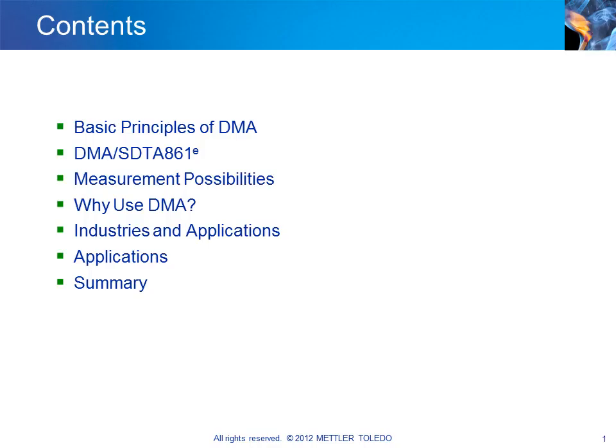In this seminar, I would like to explain the basic principles of dynamic mechanical analysis and at the same time introduce a high-performance DMA instrument. I also want to point out a number of important design features and explain their functionality. Finally, I will present several examples to illustrate the different application possibilities of the DMA technique.